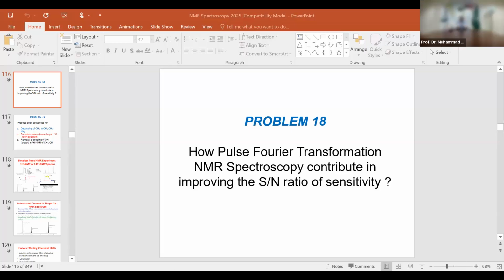Dr. Kia? Yes, sir. Till I fix the problem, can you kindly explain what is signal to noise ratio or sensitivity?